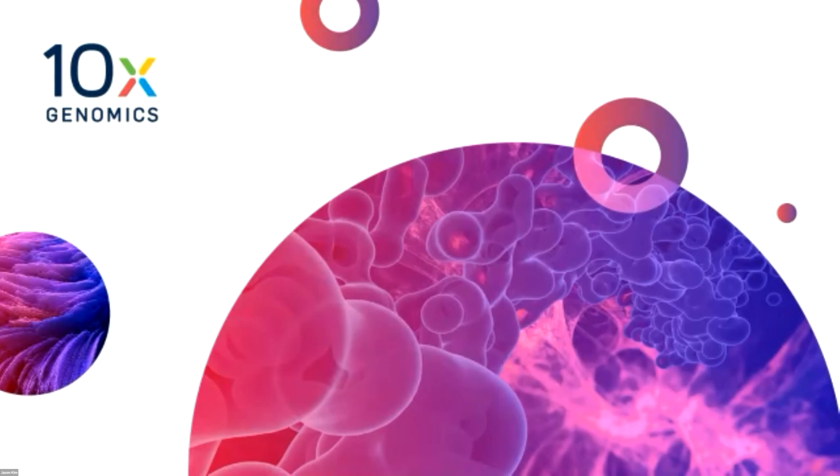Right. And you mentioned combining it with immunofluorescence. What wasn't clear to me was, based on the immunofluorescence data, can we define regions of interest based upon single or multicolor immunofluorescence, and then analyze the expression profiles within those regions of interest selectively? That's correct. So that kind of analysis is compatible with Cell Ranger and Loupe, is it? That's correct. You can either do it in an automated fashion, or there's also manual hand drawing, sort of like how a pathologist would annotate with markers on a slide. But you can do it any of those ways. Yeah, definitely. Okay.